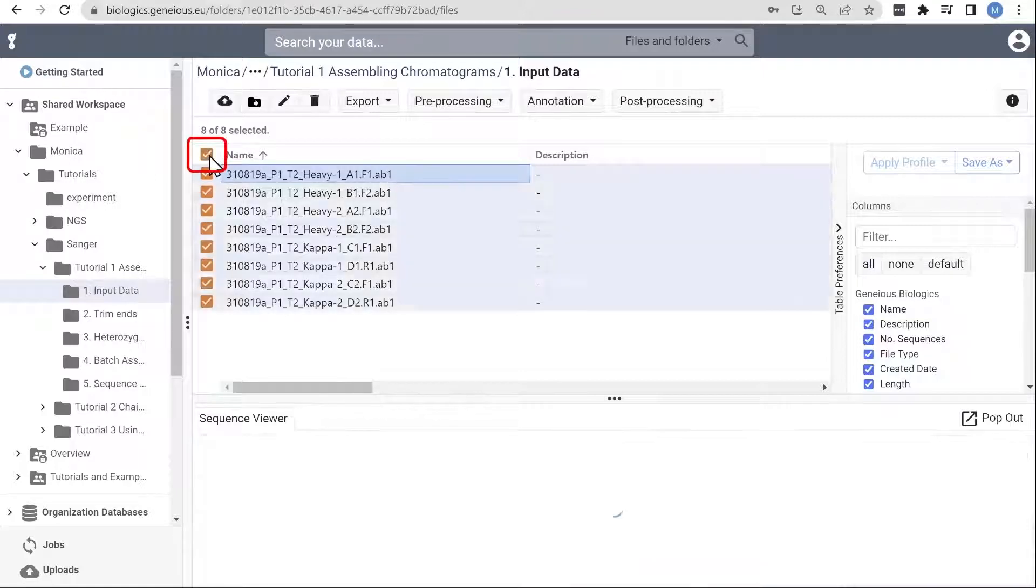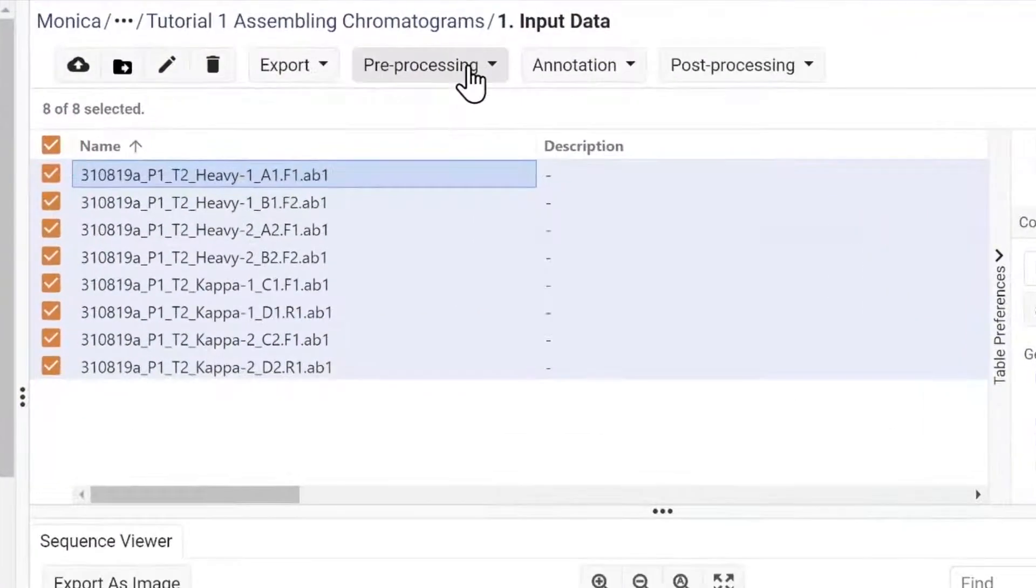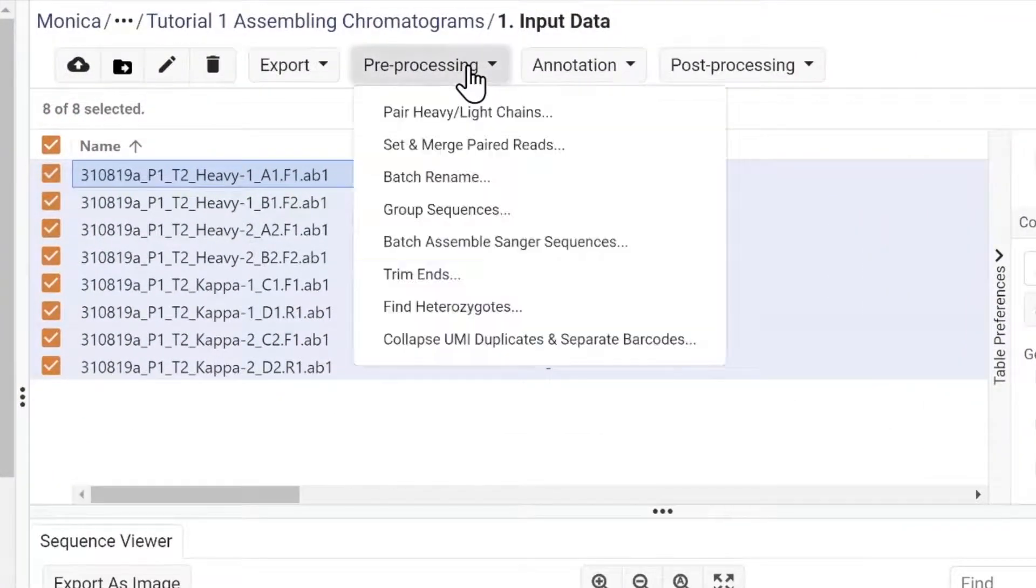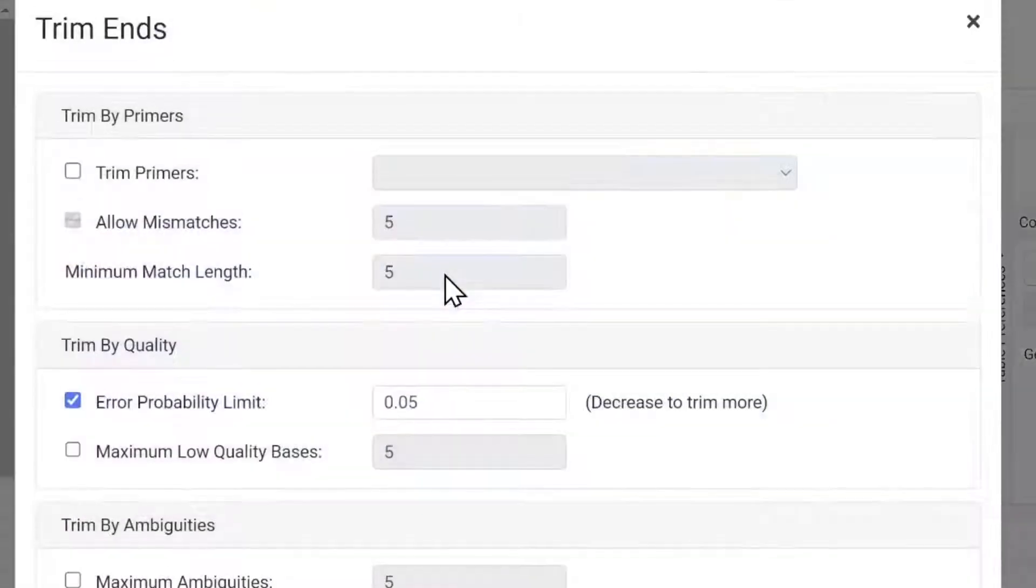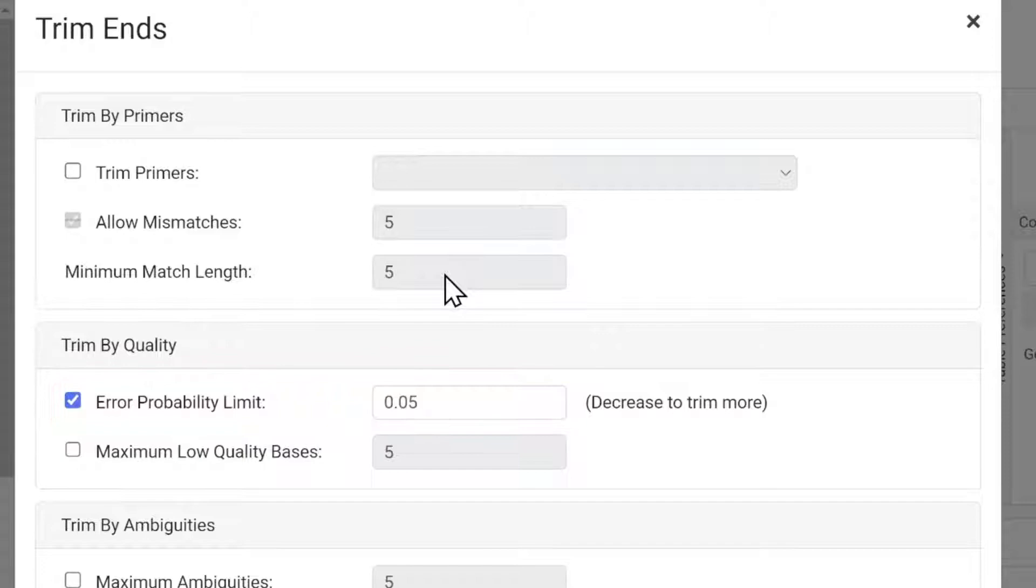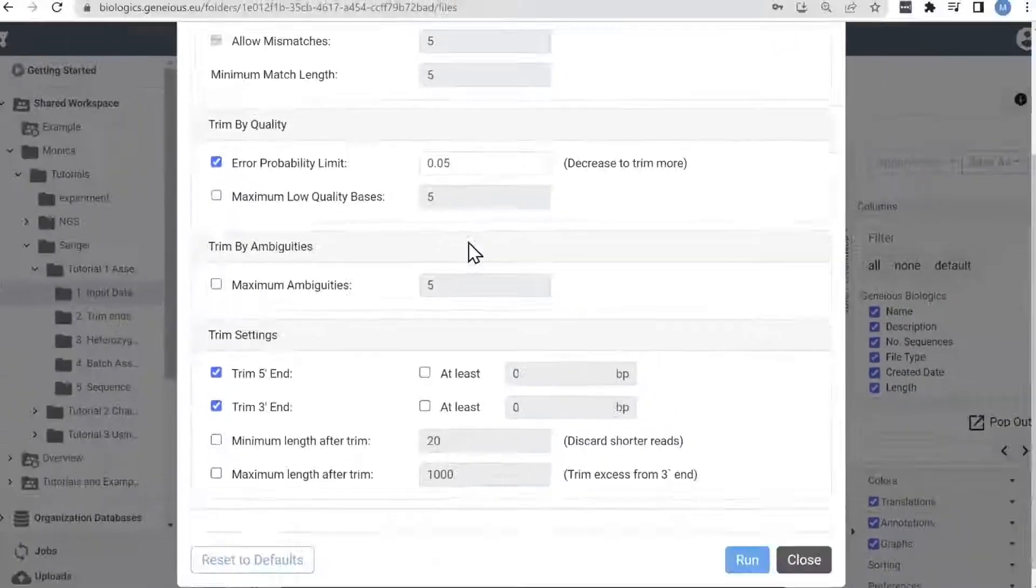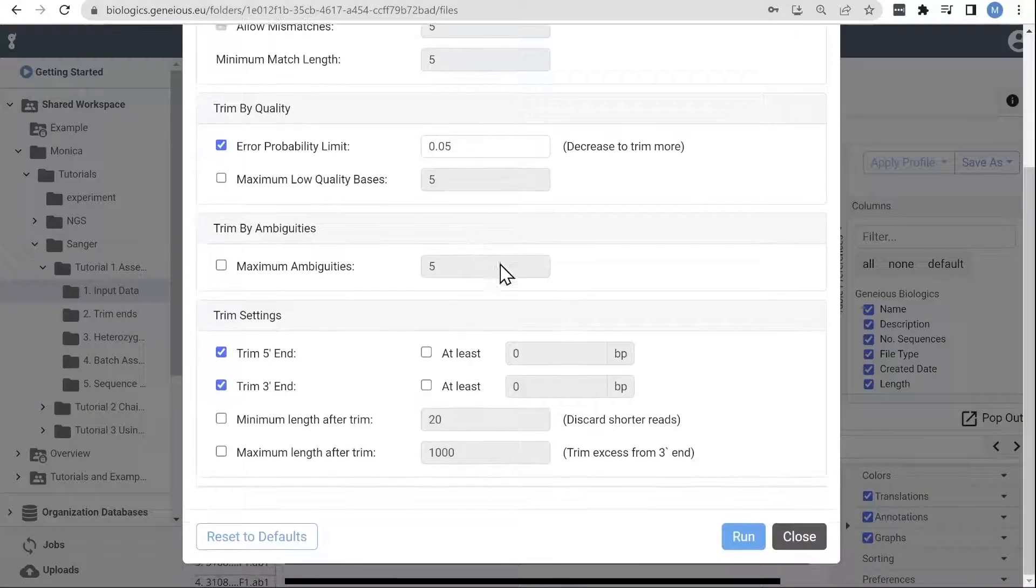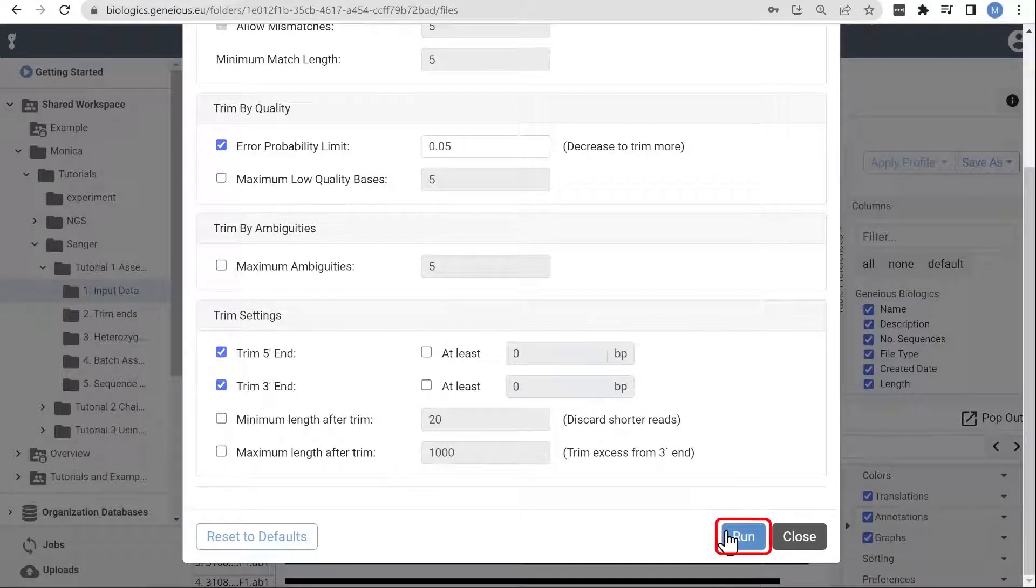The pre-processing steps can all be found in the same dropdown. First, let's trim off the low-quality ends of the sequences. The default error probability limit is 0.05, which means that the trimming tool will continue to trim bases until further trimming only improves the error rate by less than 5%. Let's run this.